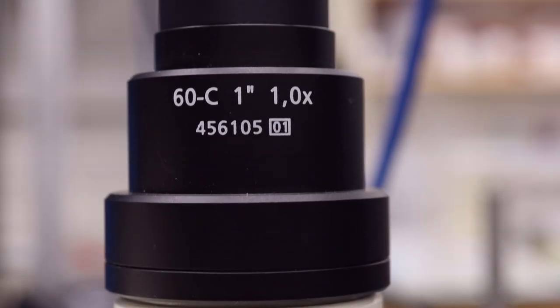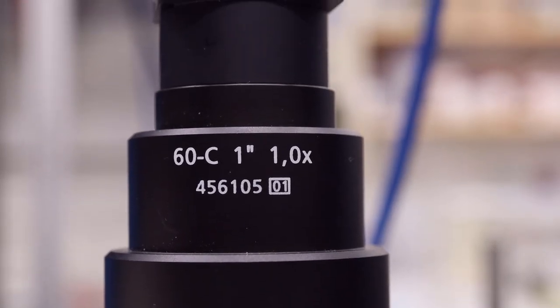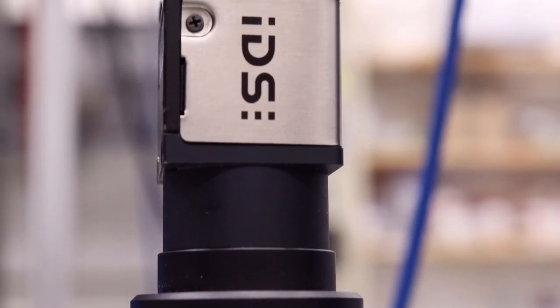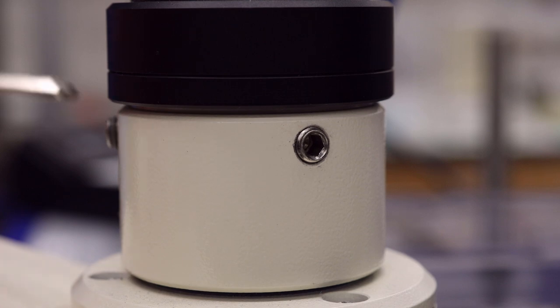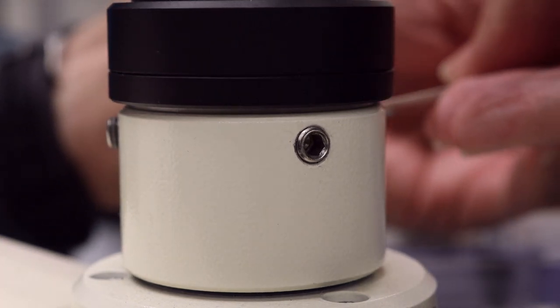Here's the camera port. The USB camera is attached through a 1x C-mount adapter. We loosen the screws at the camera port and rotate the camera as needed.